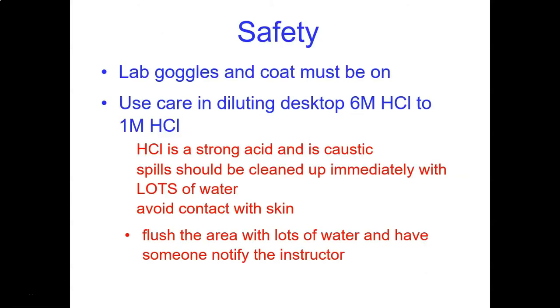Regarding safety for this lab, lab goggles and a lab coat must be on, and the 6 M HCl solution is pretty concentrated and it is a strong acid. If you spill the hydrochloric acid, make sure you clean it up immediately with lots of water and try to avoid contact with skin. And if you get it spilled on your skin, make sure you flush the skin area with lots of water and have someone notify the instructor.